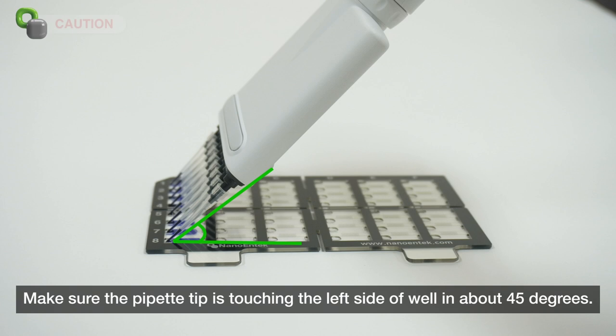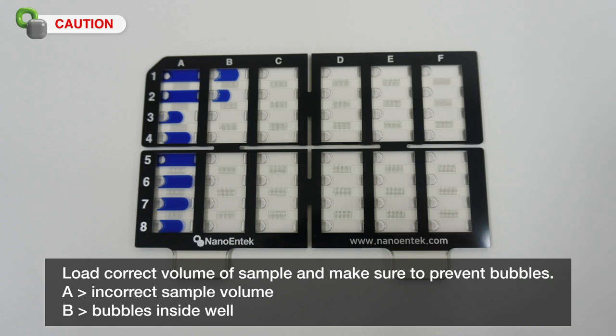Make sure the pipet tip is touching the left side of the well at about 45 degrees. Load correct volume of sample and make sure to prevent bubbles.